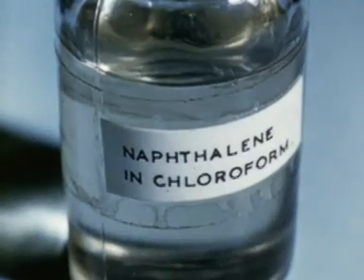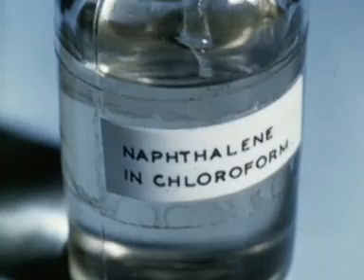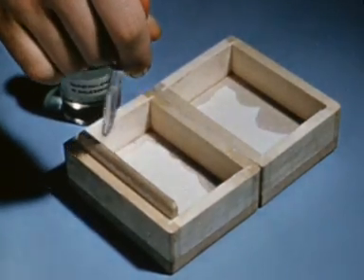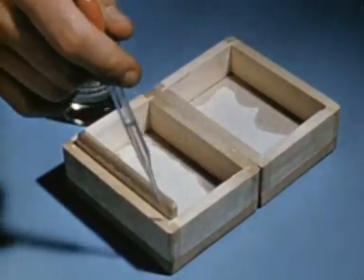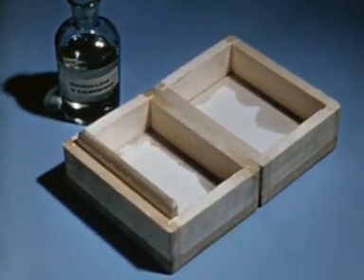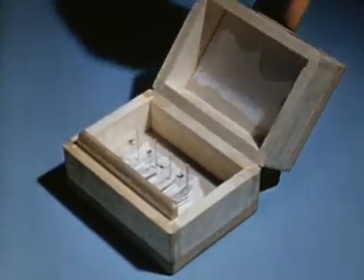A solution of naphthalene and chloroform, to which beech tar creosote has been added, is used in all containers to preserve the specimens from attack by ants and other creatures. It is applied to all the openings, joints and corners. Then the specimens are placed inside and the lid tightly closed. The preservative should be renewed every six months.